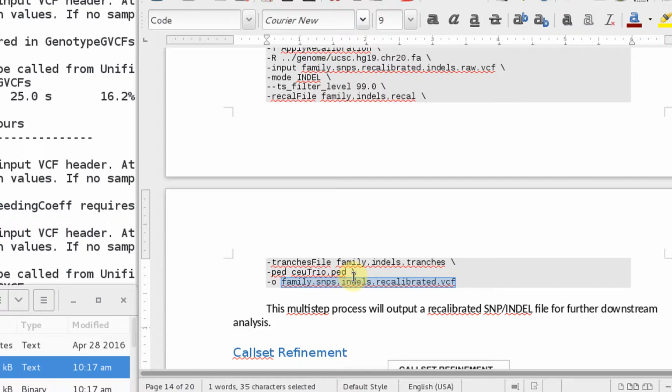And so at the end of that step, you have just finished phase 2 of variant calling discovery. So you're now two-thirds of the way done. Now, none of this was done at command line because, as I mentioned, this sample was such a small region, but you shouldn't have a problem if you have several samples that have been done in exome sequencing or whole genome.